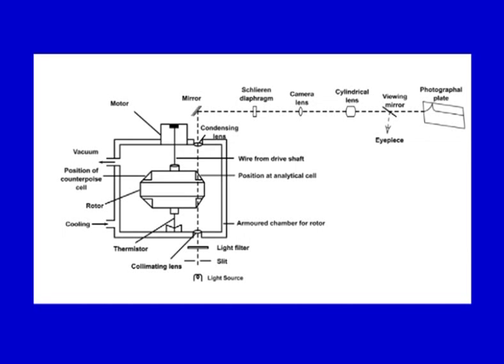In more advanced instruments, like I said, the photographic detector could be replaced by an electronic scanning system, and data could be collected right away and could be analyzed and seen as the experiment is going on. So, this is a very simple schematic here, if you can go through. If you can see here, this is a slit, there is a collimating lens I was talking about.